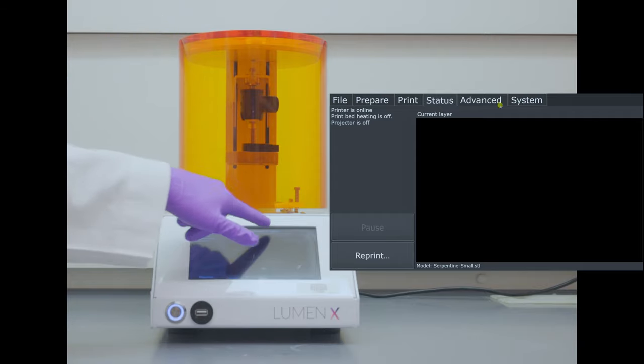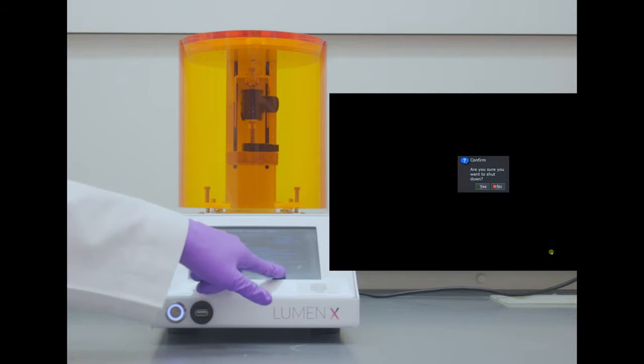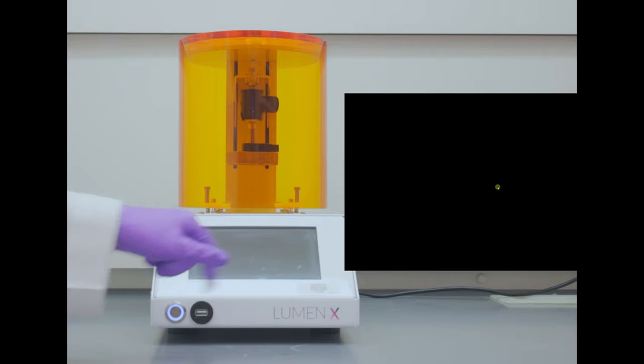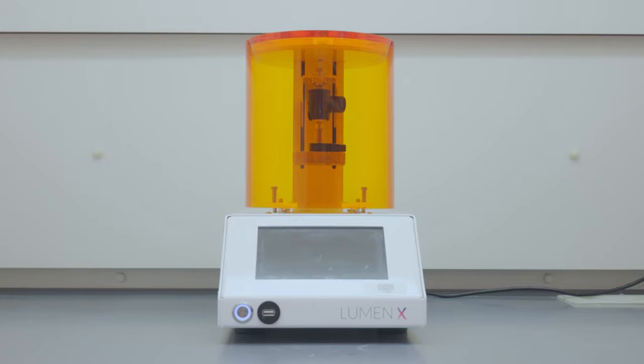Now to shut down, go to the systems menu and tap on shutdown and tap yes. If the printer is powered off for a prolonged period of time, the PC can discharge and lose BIOS settings and in turn cause PC booting issues. So please leave the printer powered on.